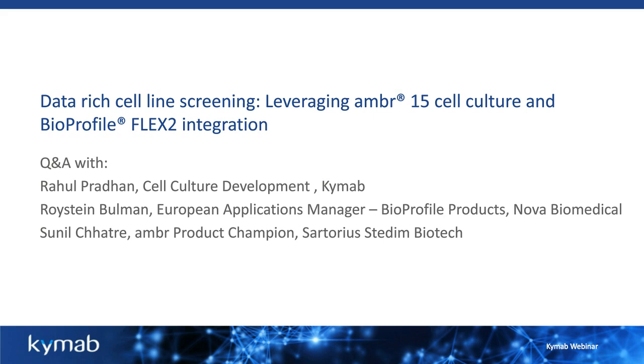Thank you very much for that, Sunil. A simple question for Rahul. Was this a fed batch or perfusion process? This is a fed batch process. Thank you.